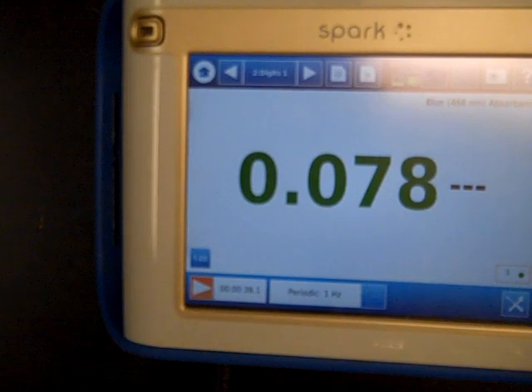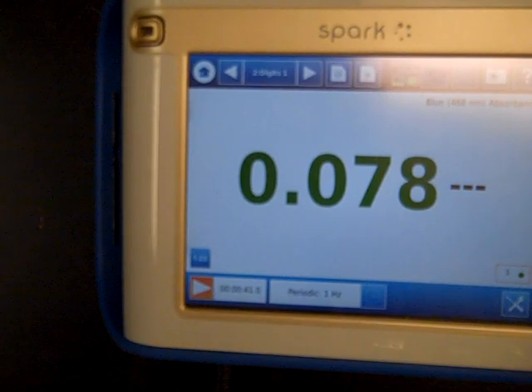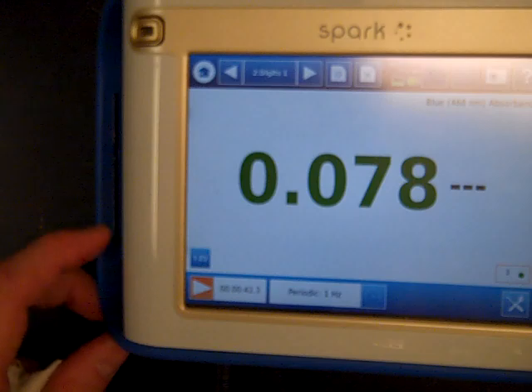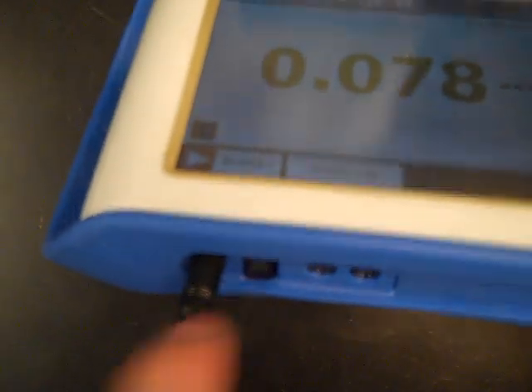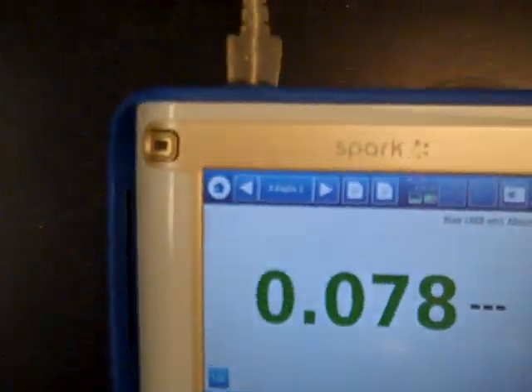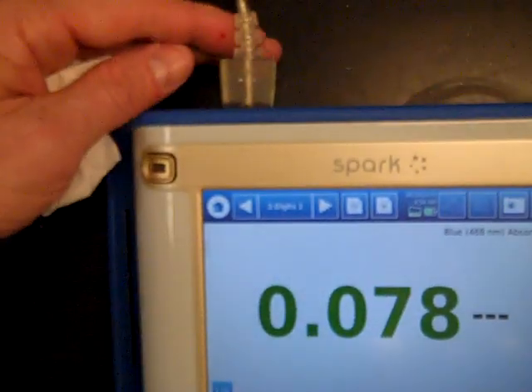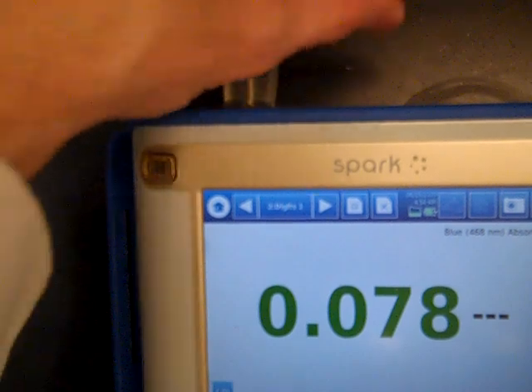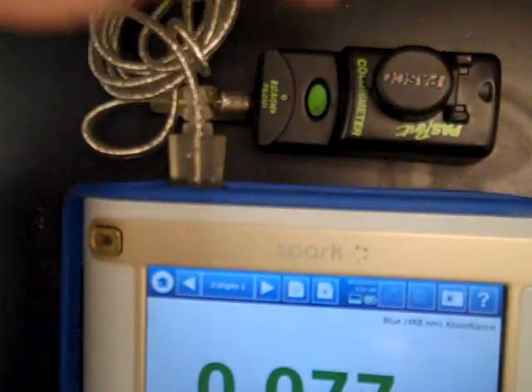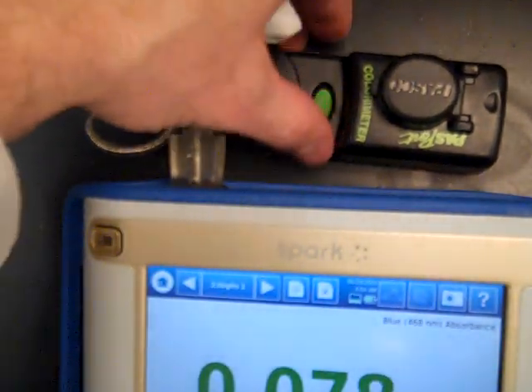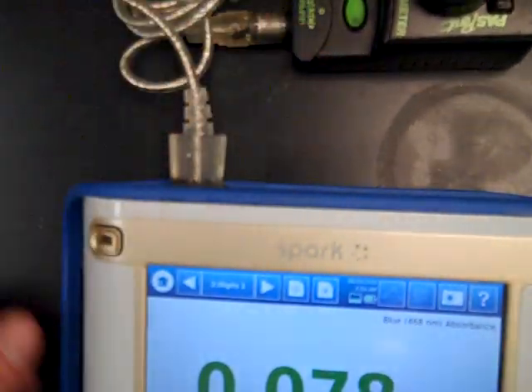Now that we have our Spark hooked up, the power cord is plugged in, we've pressed the power button, and we've already hooked up the cable to our colorimeter, which recognizes it correctly.